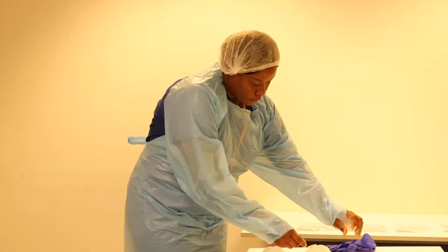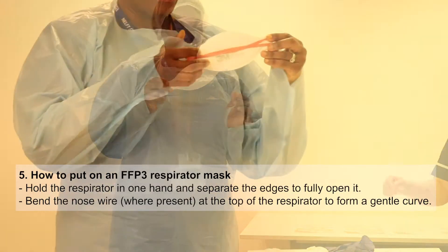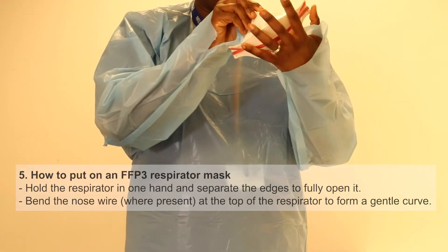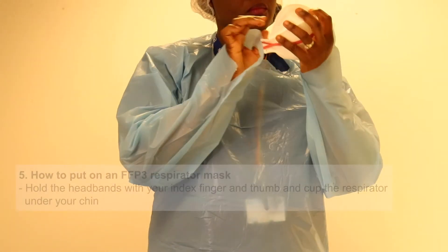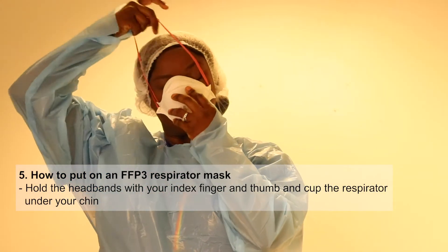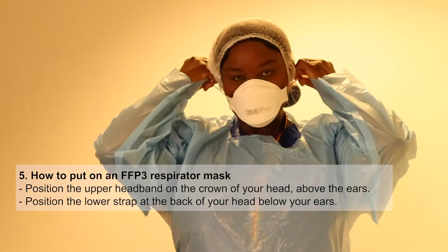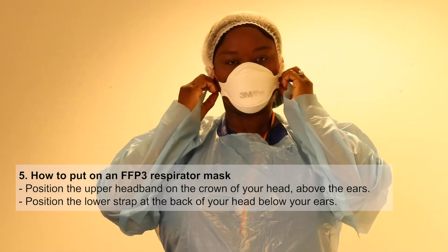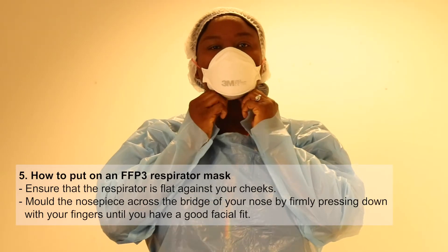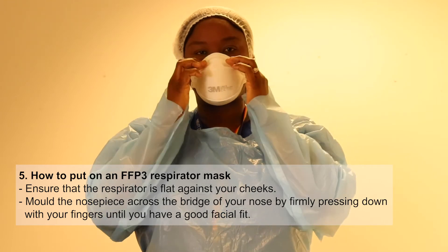Next you would put on your FFP3 mask — only the one you have been trained on. This is a 3M one. Open the flaps up, cup it in your hand, pop it over your face, and pull the ties around the back. One should be above the ear and the other below for it to fit properly. You then mold it to your face.